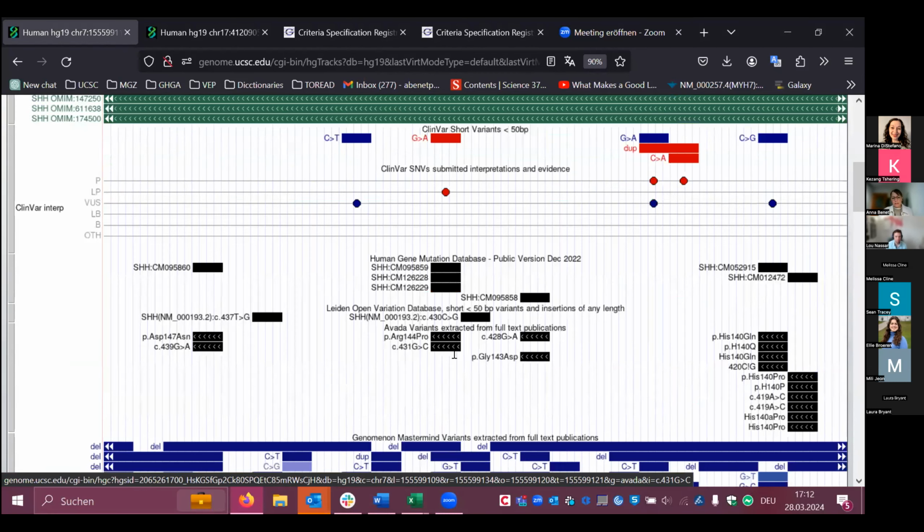If you click here, it opens a small window. That window shows different tracks that have been grouped together by specialists in data interpretation, who think they are useful for interpreting either clinical SNVs or CNVs. And now we are developing the non-coding SNVs data set.